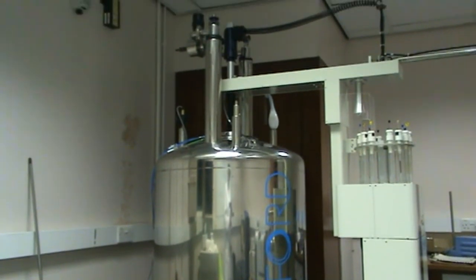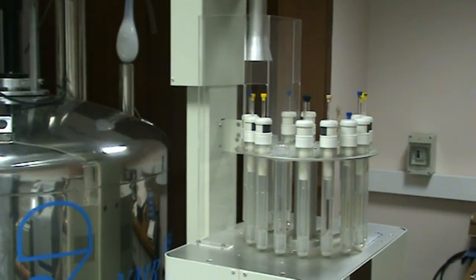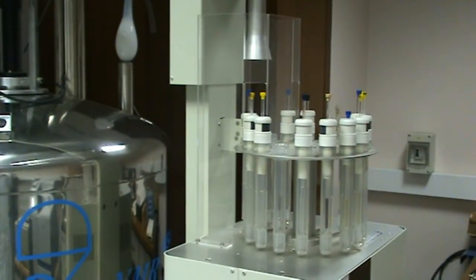This is the NMR spectrometer. It uses a very large magnet and should not be approached with any magnetic sensitive materials or large magnetic objects. These should be left on the other side of the room.